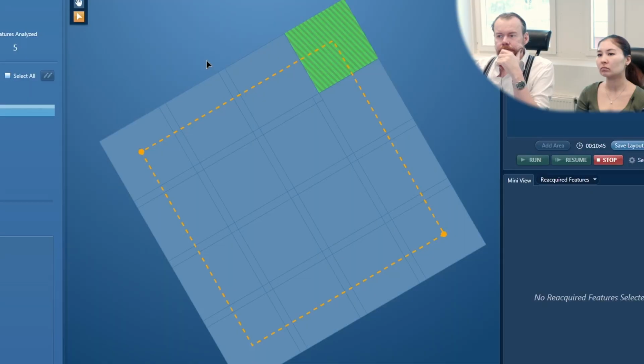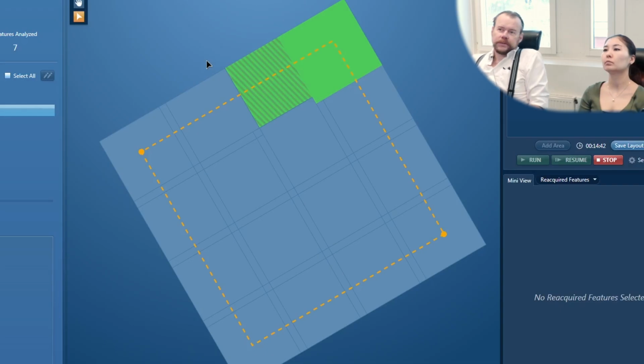Is there some sort of estimate on how much time it takes? Yeah, I mean, you remember when we scanned initially? Since it has such a high beam intensity, it goes pretty fast. If you look, you will see it will soon be fully green. It depends on how many particles they contain also. I mean, it goes and scans each particle individually. You see? Yeah. So perhaps 10 minutes.